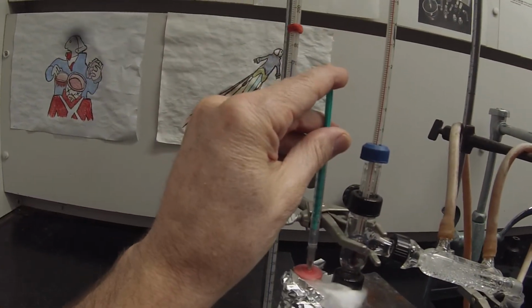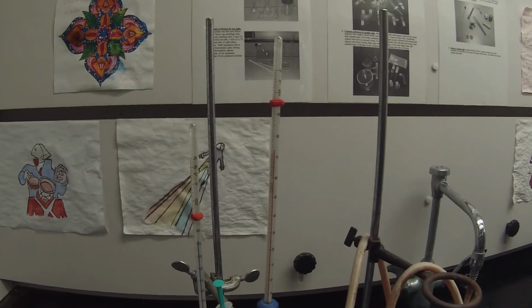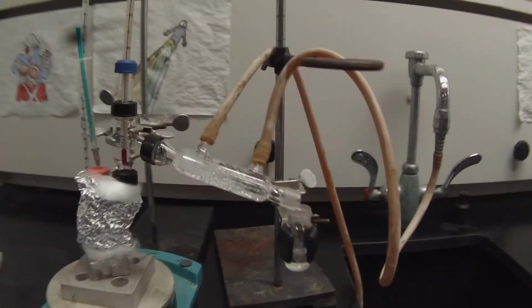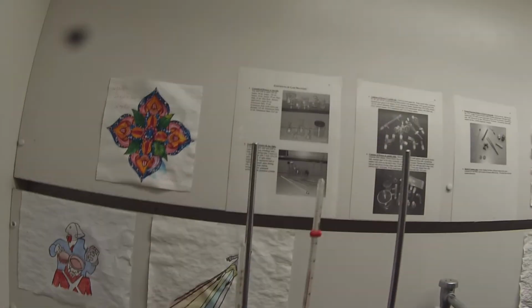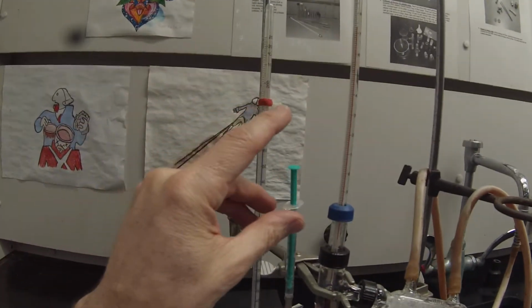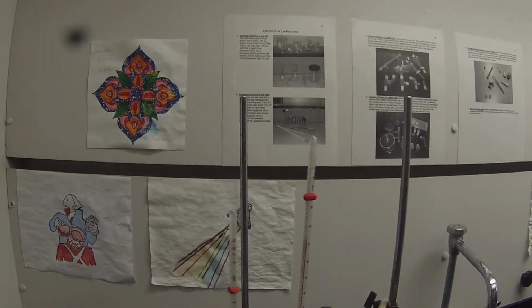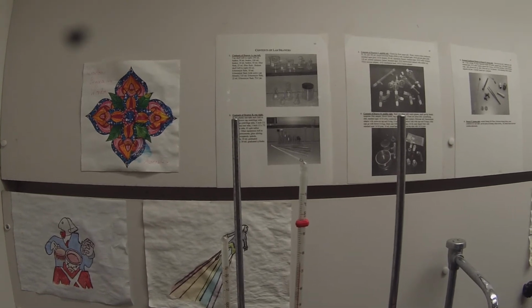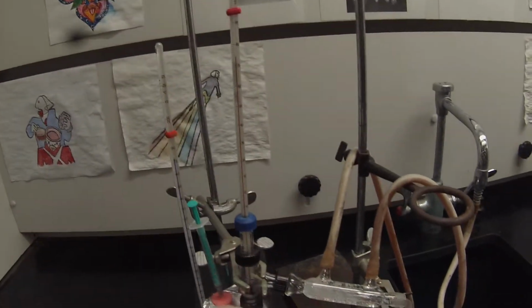We'll add another 0.1. Liquid is collecting. Hopefully not spilling down the side. A little surface tension is kind of pulling it up against the side. Definitely likes to sit at about 74 as it's distilling over. So I'm going to add another 0.1. And sitting between 74 and 75 as the liquid is actually coming.